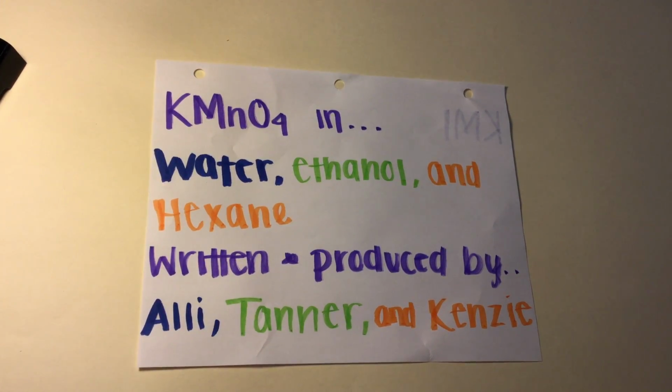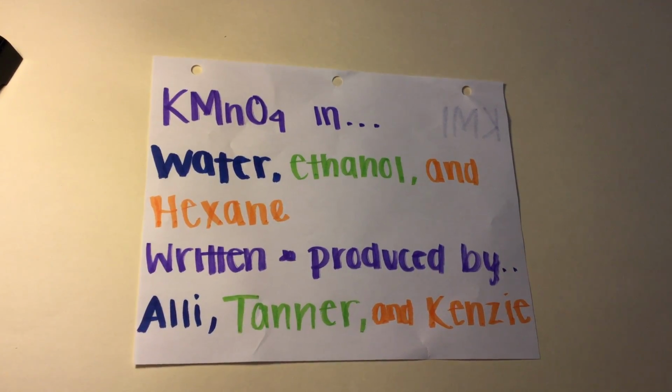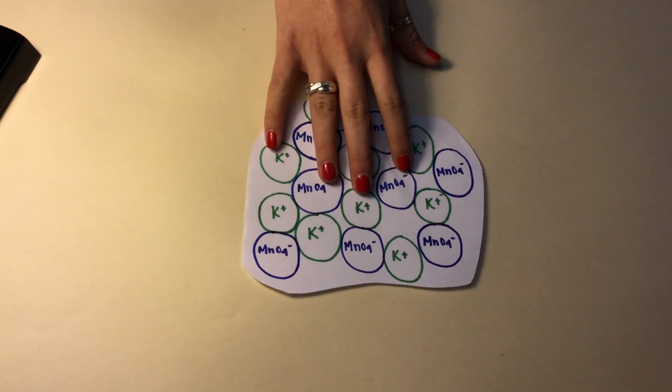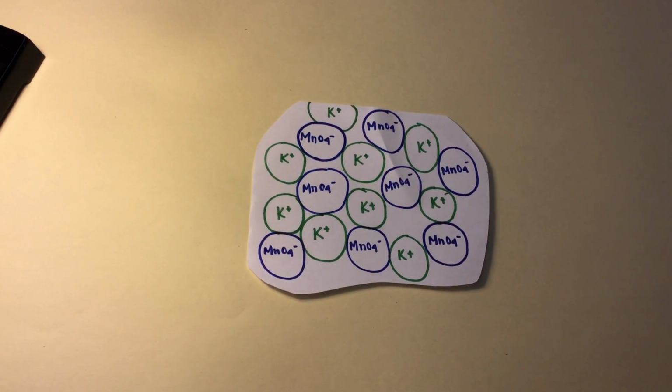Today we will be discussing the solubility of KMnO4, also known as potassium permanganate, in water, hexane, and ethanol. When tested, the KMnO4 only dissolved completely in water, turning it into a deep purple solution. In hexane and ethanol, the KMnO4 remained in its crystal state.